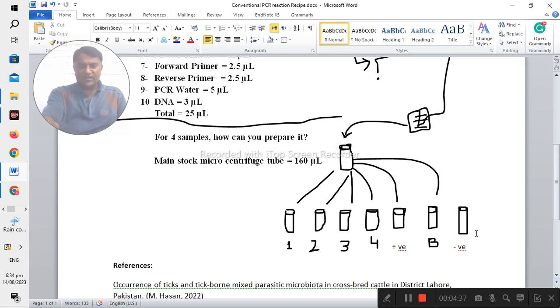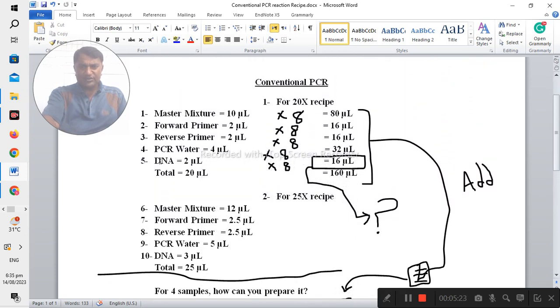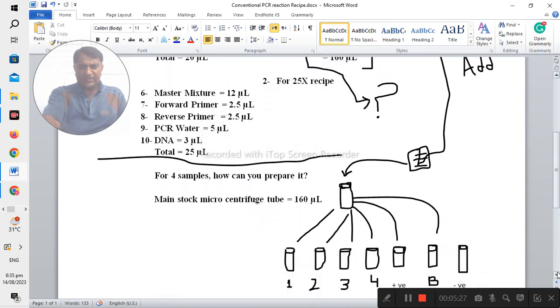After that, add 2 microliters of your sample into each tube — tubes one, two, three, and four. For the positive control, add 2 microliters of positive sample; for the negative control, add 2 microliters; and for the blank, use only plain water. You add 18 microliters to each tube because the 2 microliters of DNA sample are added at the end of the recipe preparation.